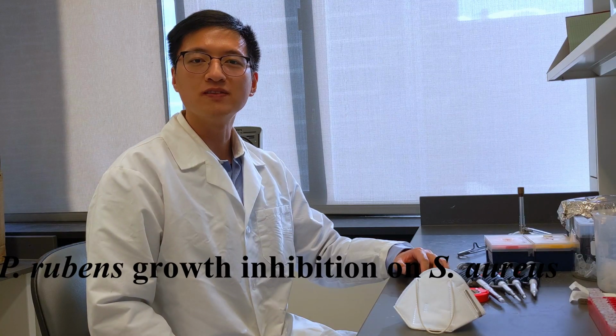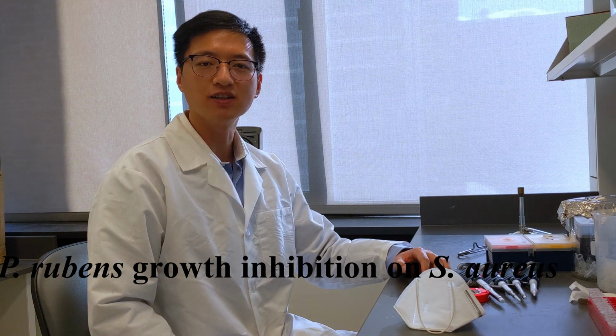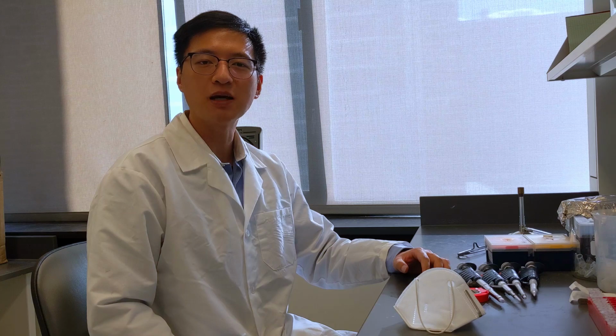The phenomenon Fleming observed is that P. rubens inhibit the growth of bacteria that are near its colony. We're going to use a similar experiment to demonstrate this.